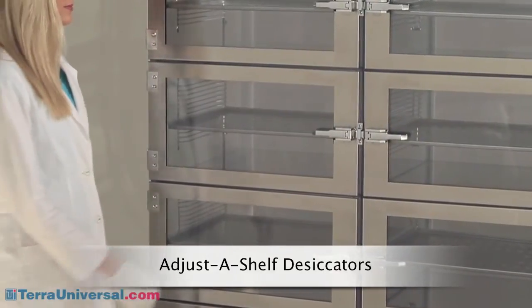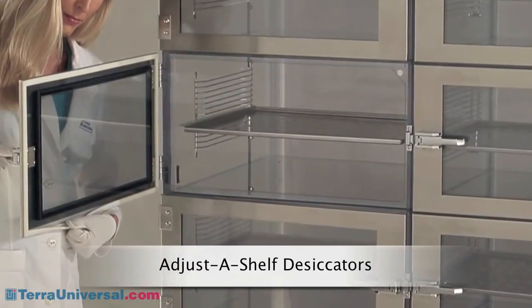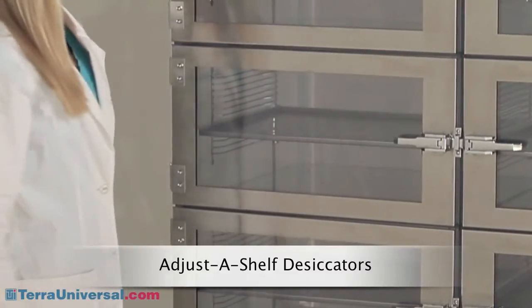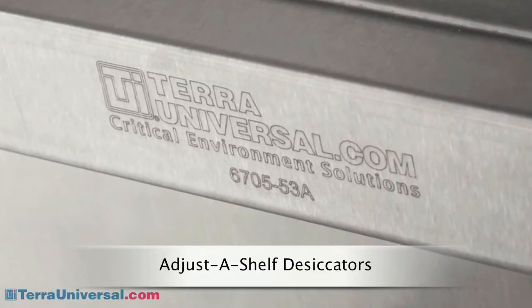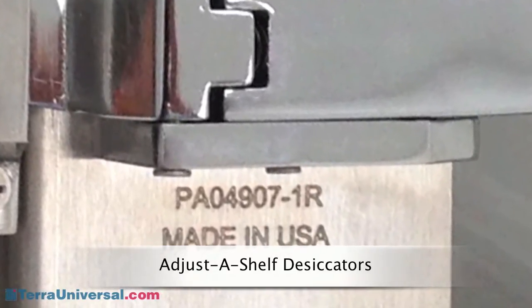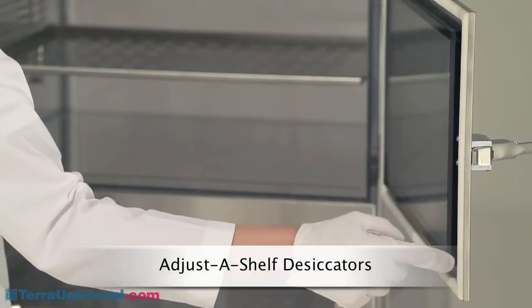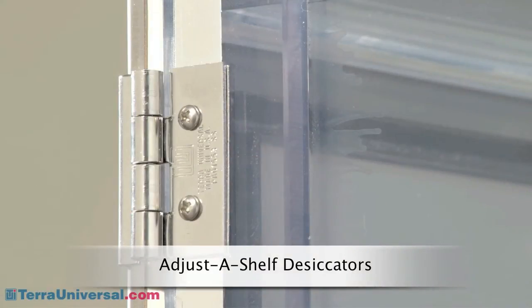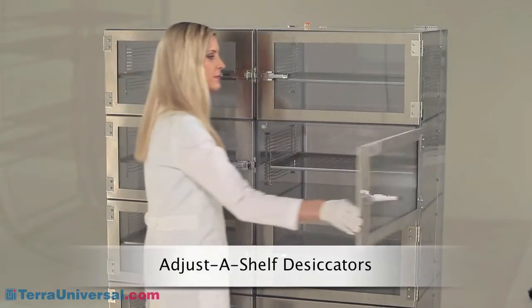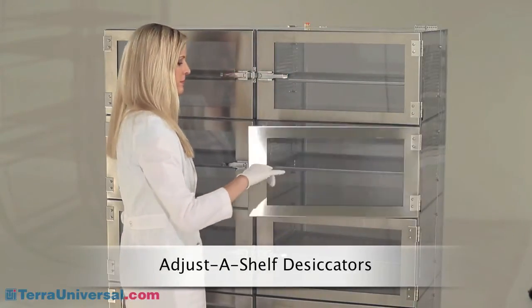Stainless steel door frames make these the strongest, most durable doors on the market. The one-piece gasketing is mechanically attached to the door frame to eliminate adhesives and outgassing problems — it will not creep or deform, and its hollow-formed construction seals better and longer than weather-stripping-style gaskets. Like other chamber hardware, each door is stamped with a Terra part number, and any desiccator component can be replaced with parts shipped from Terra's stocked inventory. The plastic doors feature a double-wall design that enhances rigidity and strength for a better seal. All stainless steel hinges stand up to years of heavy use without sagging. All adjust-a-shelf desiccators feature electro-polished 304 stainless steel racks with adjustable shelf placement, and you can choose between electro-polished stainless steel shelves, trays, or reinforced plastic shelves.